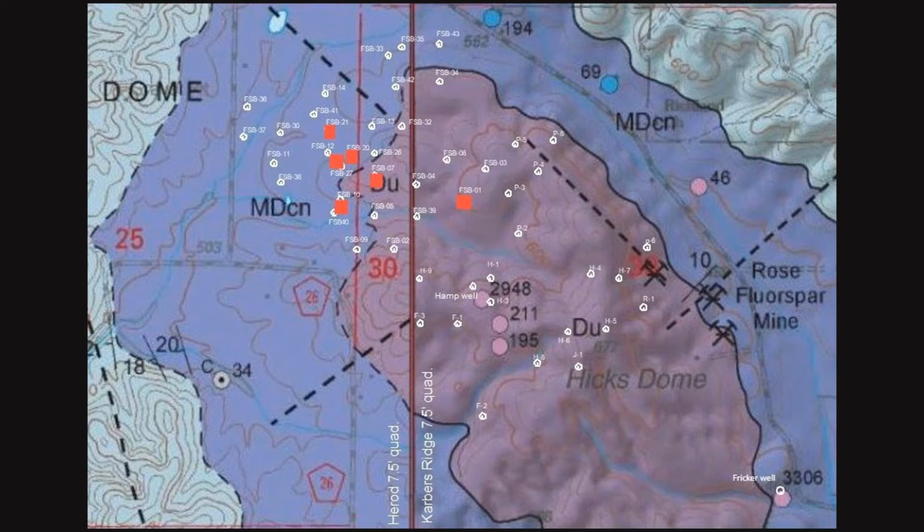Thin sections were then made of these cores for further analysis, and this past year some of those sections were sent to us at Miami for mineralogical characterization. So the cores that we have, or that we have thin sections of, are located here on the map in the red markers.